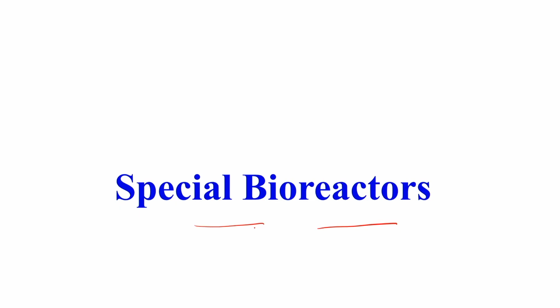So, hello everyone. We are going to start the last lecture of week 7. This is a different configuration of bioreactor. We are calling it a special bioreactor.